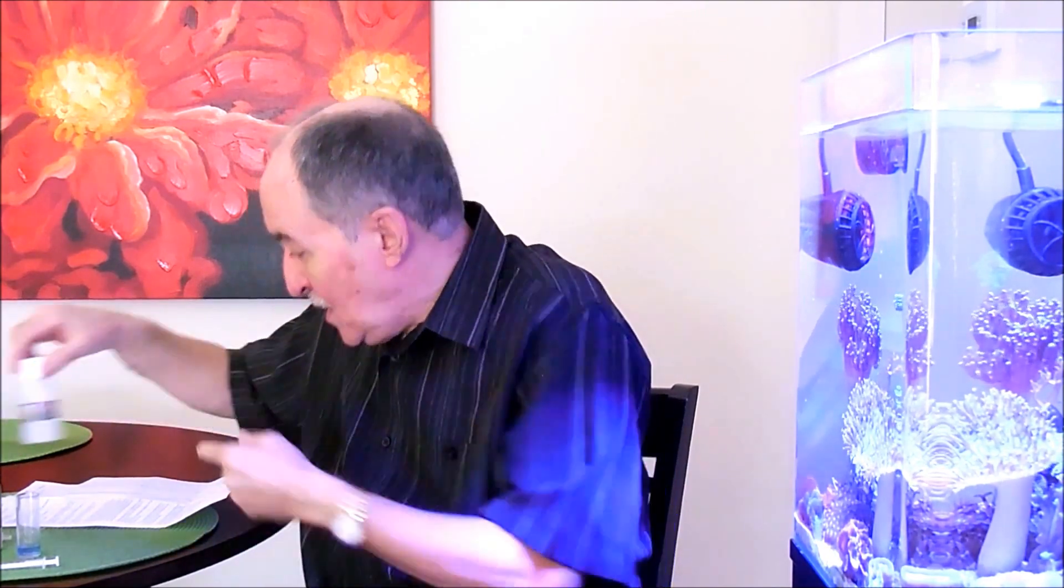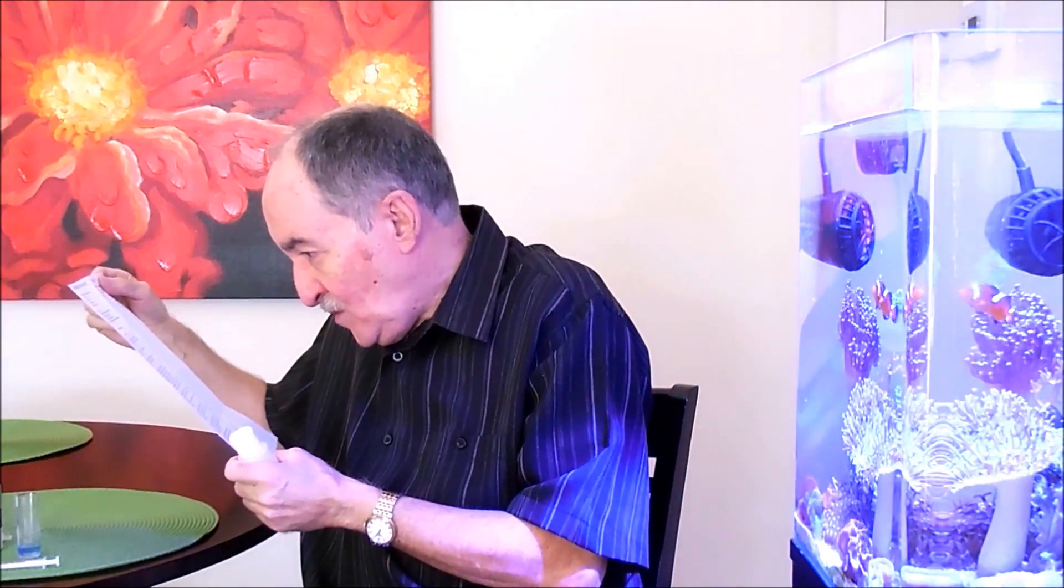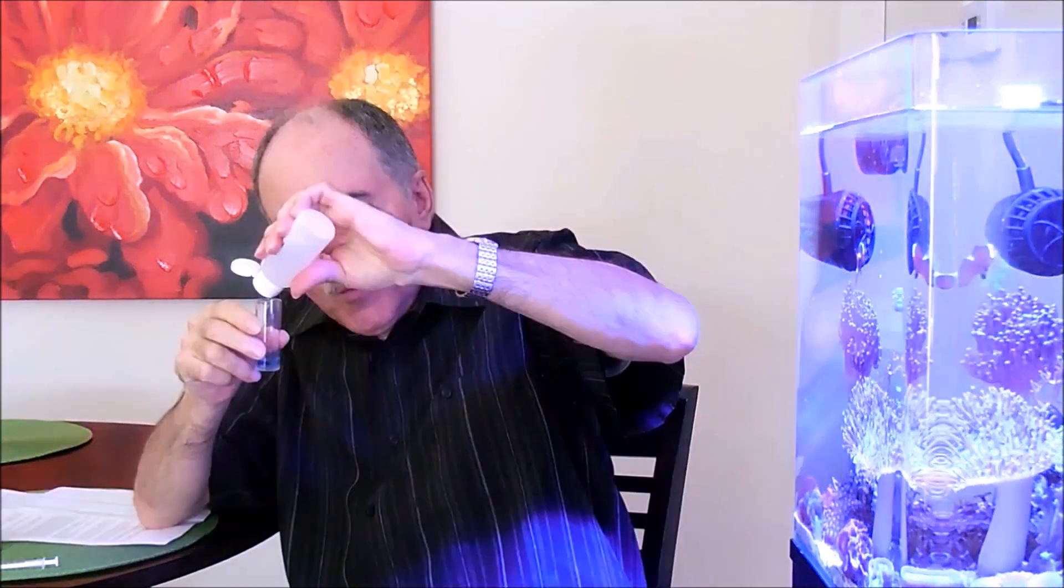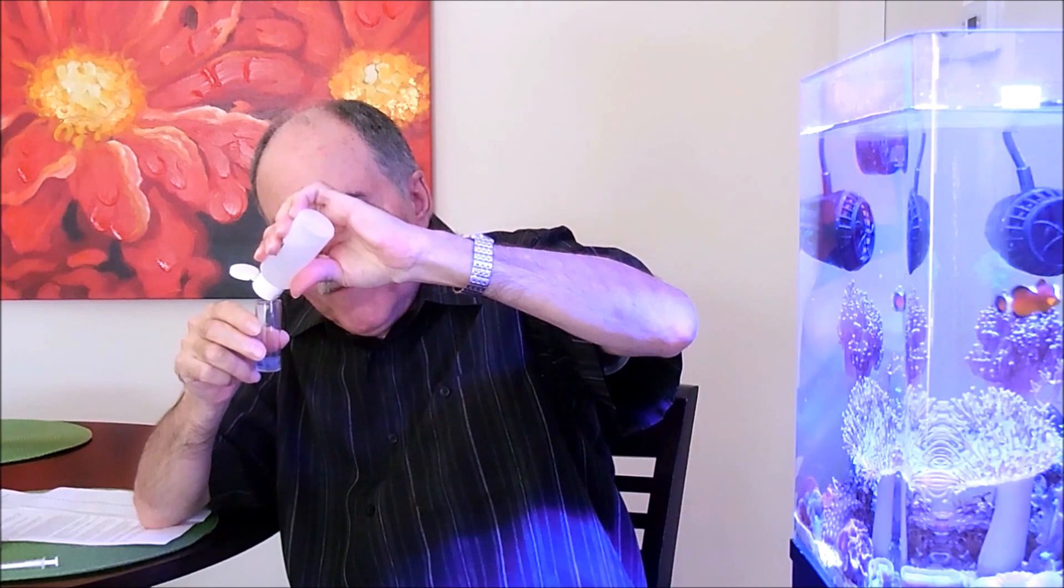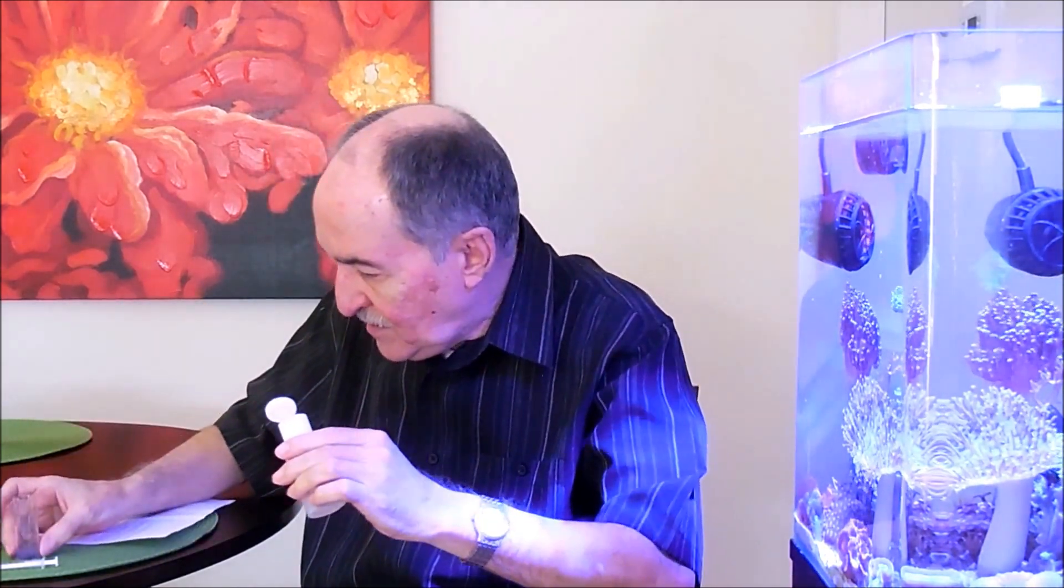Step 3, it says to add 8 drops of Cal 2. And once you add the 8 drops of Cal 2, you have to swirl it for 10 seconds, not shake. Let's put this down here.